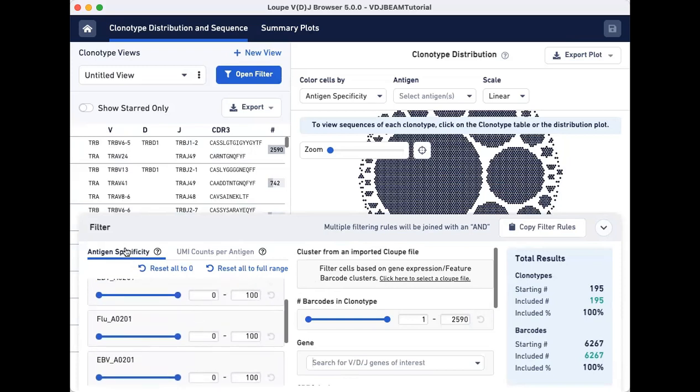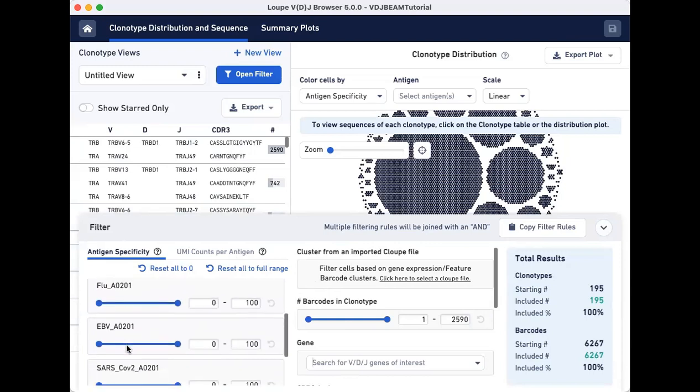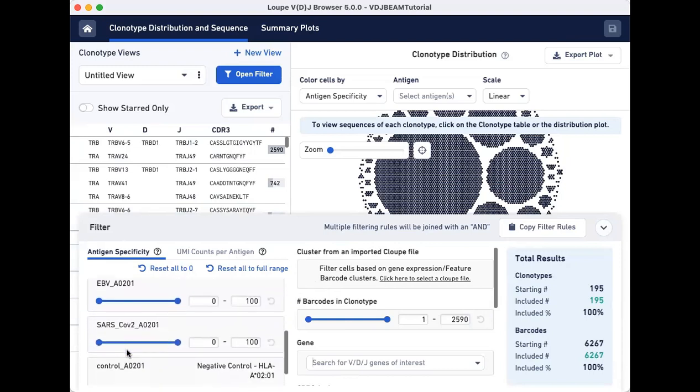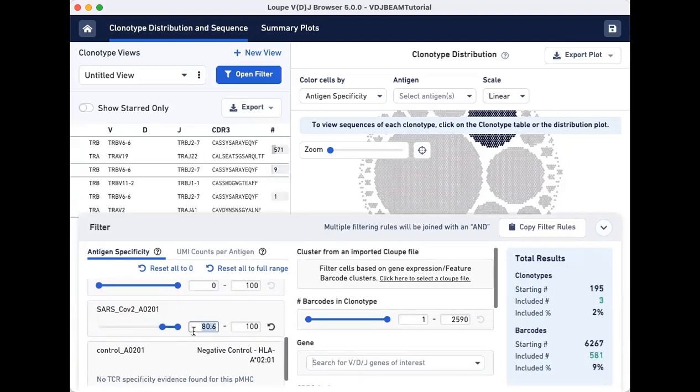Select the Antigen Specificity tab and scroll down to SARS-CoV-2 A0201. Use the sliding scale or manually change the lower limit to 90.